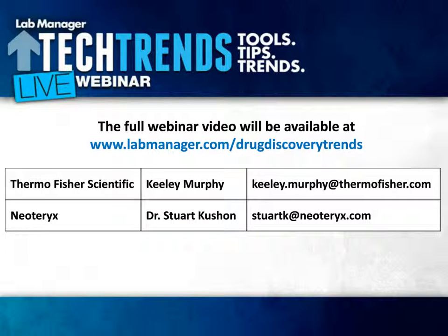And this is a lot different from other high-resolution instruments where you have to recalibrate the system very frequently, and for some systems during your actual analytical run. So you're able to calibrate once with an external calibration and maintain your level of mass accuracy throughout the course of your entire analytical run, even if it's for an extended period of time, for 1 or 2 days.